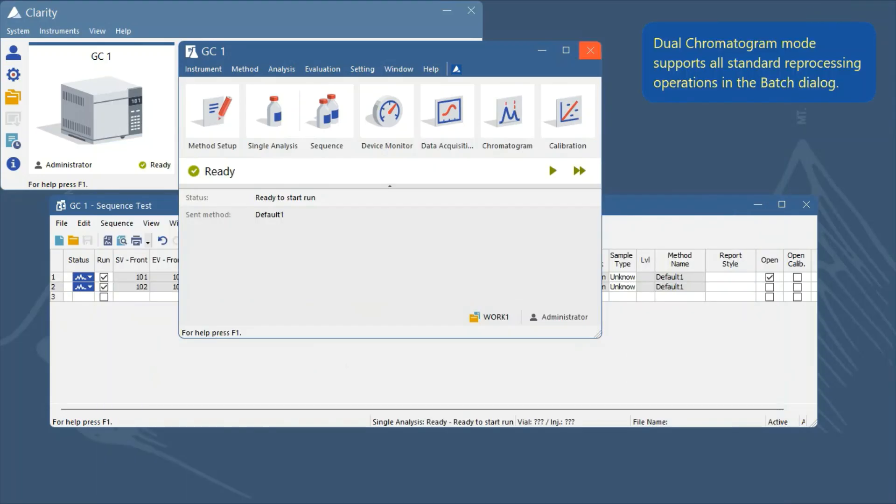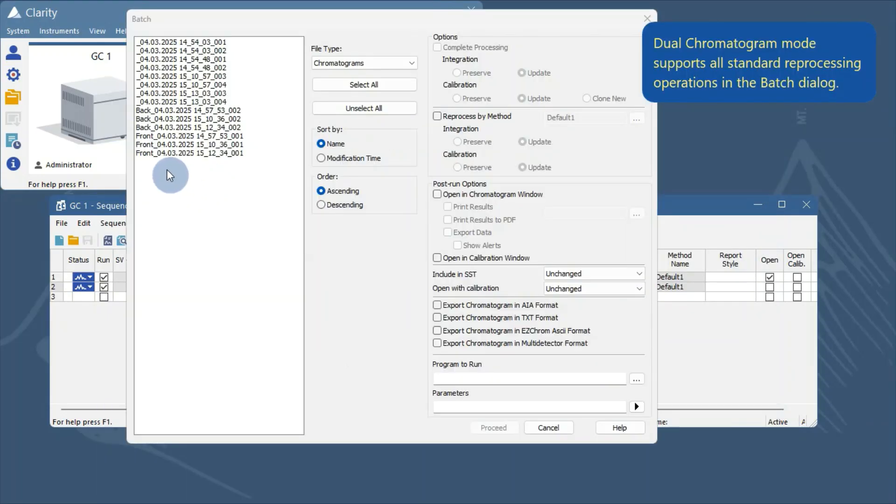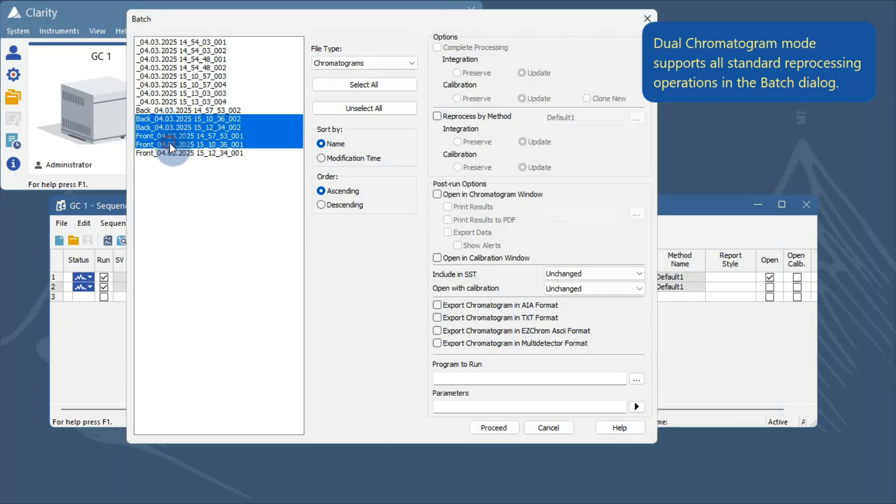The dual chromatogram mode supports all standard reprocessing operations, allowing for flexible data evaluation.